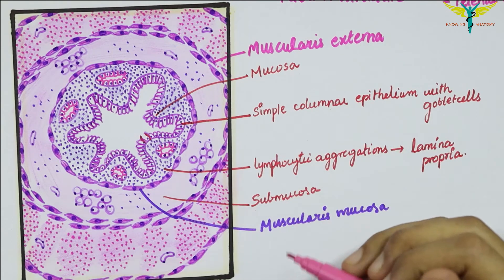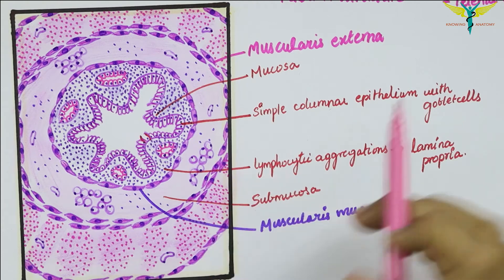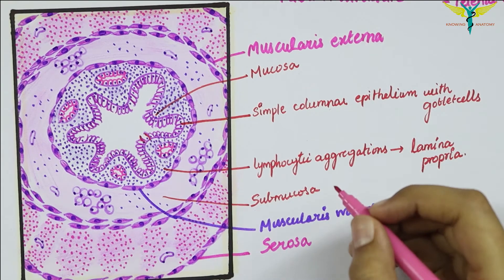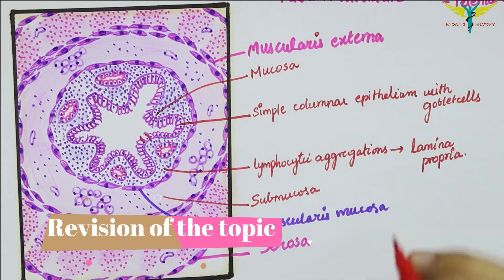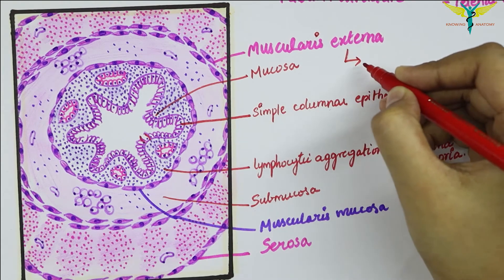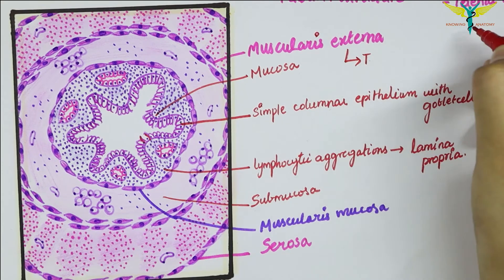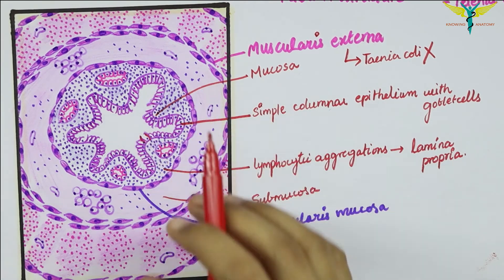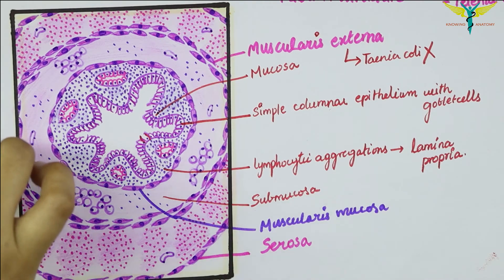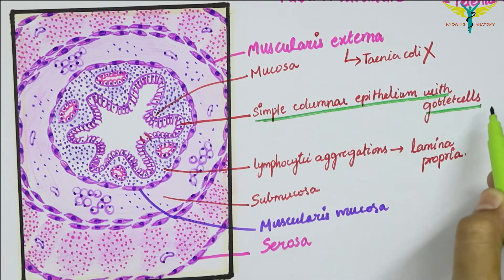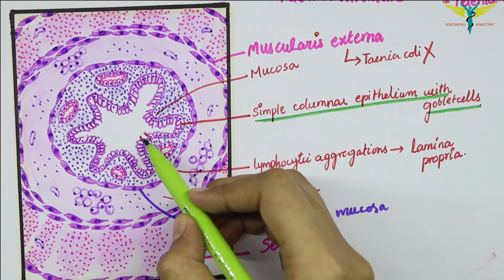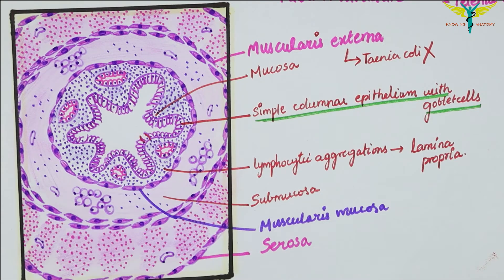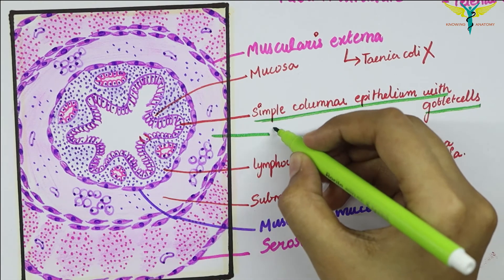The longitudinal muscle coat is completely and equally thick all around in the vermiform appendix, and the taenia coli are not present — this is the main differentiation point between the appendix and the colon. The crypts are poorly present, and the lining epithelium is simple columnar epithelium containing goblet cells. You can see many lymphoid aggregations in the mucosa, and the submucosa also shows lymphatic nodules.